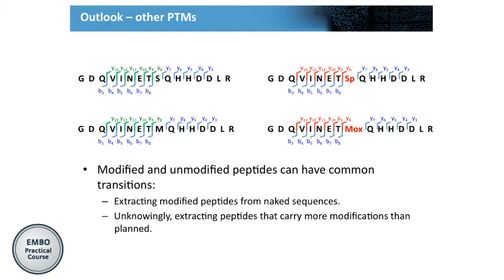It can also be a problem when there are modifications that we didn't consider or didn't think about. They fall within the same window, for example, oxidation, and then we would be extracting one hoping only to find a certain peptide of interest, and we're actually extracting 2, the modified and unmodified version. There could be very different modifications that we don't even know what they mean, and we still get more than 1 peak. This is a difference between SWATH and SRM. In SRM, since we have the first filter that is fairly narrow, we can pinpoint it to small modifications, as we've discussed before with the synthetic peptides. In SWATH, we have a much bigger window on the Q1, and therefore we also have to start considering many more options of what could be happening to this peptide that would affect or create these results.